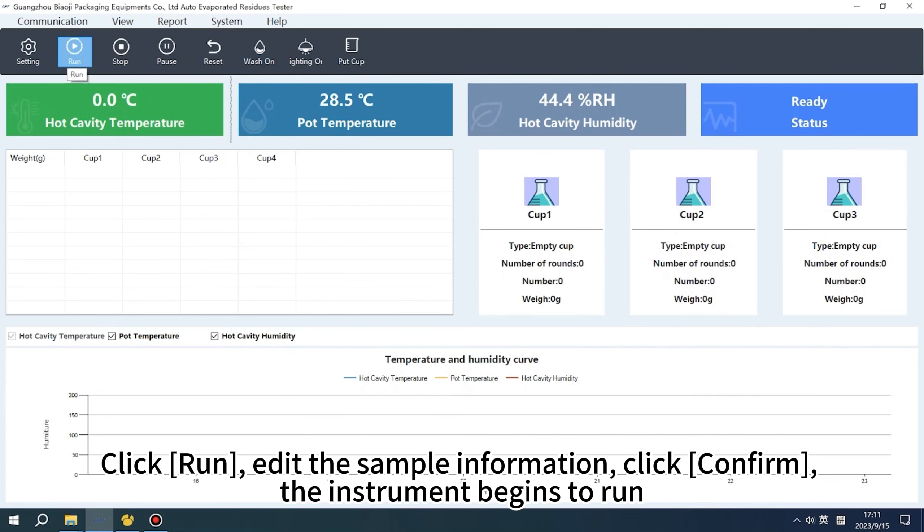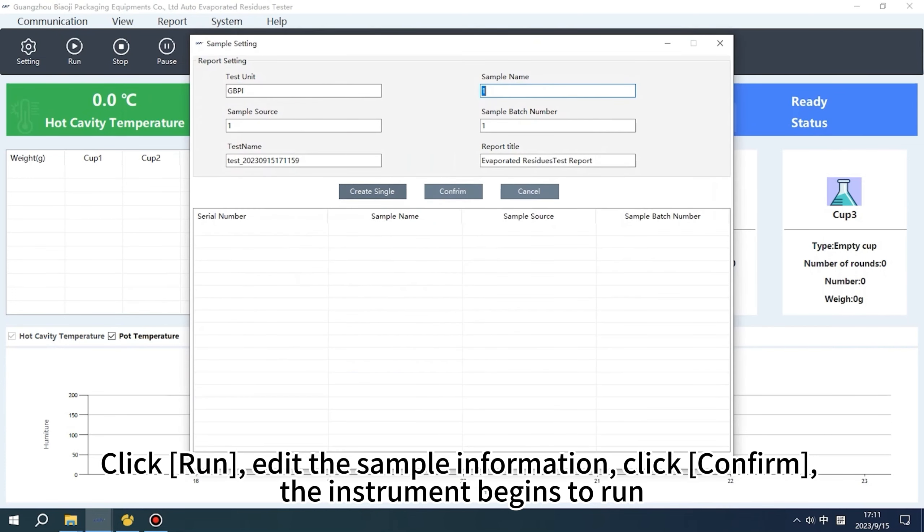Click run, edit the sample information, click confirm. The instrument begins to run.